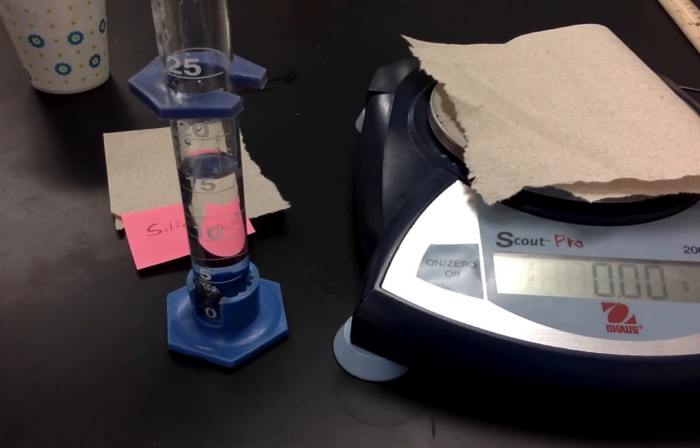Then use water displacement. So figure out how much the water level rose by. That's going to be the volume of your silicon. And then use the mass and volume of the silicon to determine the density of silicon. Then you can compare that value to your estimate and then tell me about some things that you learned in this lab.